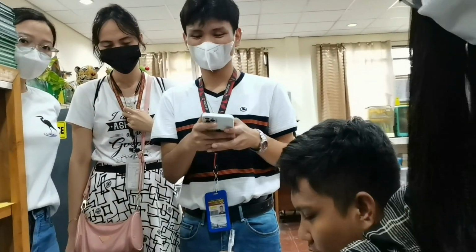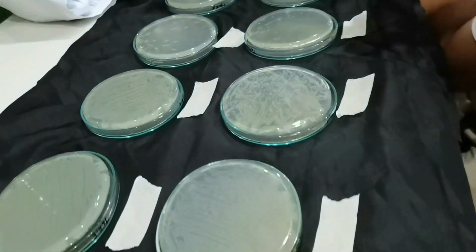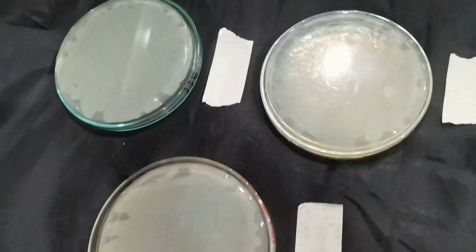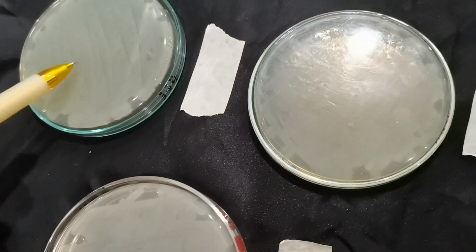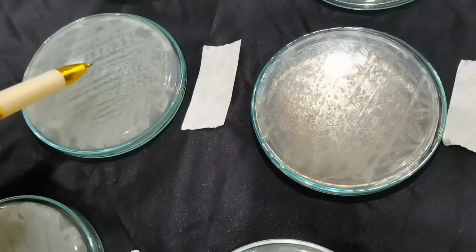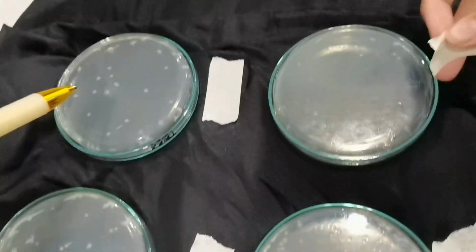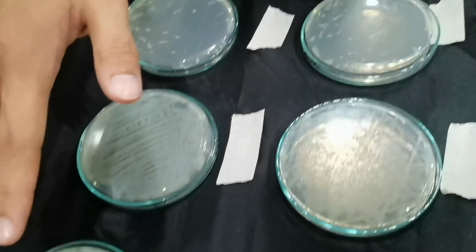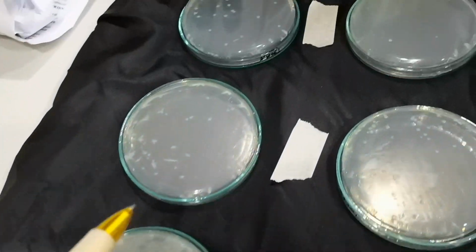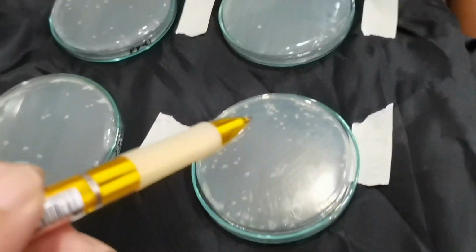Why are we rejoicing, Lloyd? Because you can see a difference between the duration of time exposed to UV. How many minutes is this? 2 minutes. Then 5, 10, and then 30. And then what's the difference between the two rows? We have here the ones exposed to visible light. Here we have the ones unexposed to visible light.